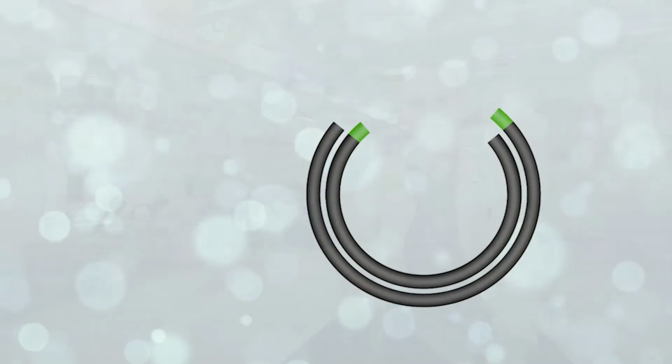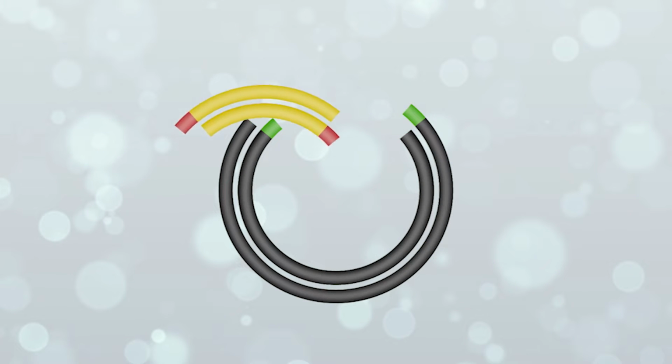But there is one annoying feature, and that is all the different standards that are used. Let me explain why. Golden Gate cloning is a great method if you have the correct assembly standards at your disposal, but I've had too many occasions where my building blocks weren't compatible.